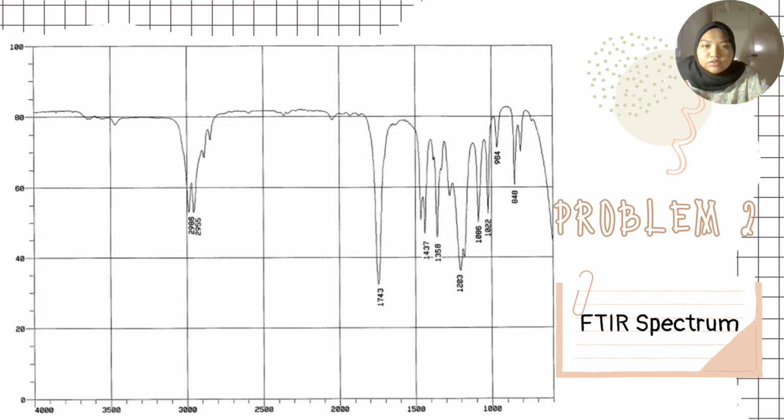This slide is showing the FTIR spectrum. My problem has two spectra, which are FTIR and NMR.